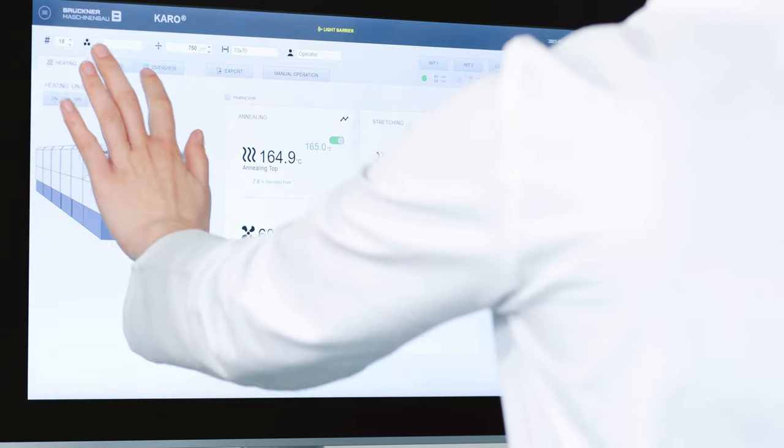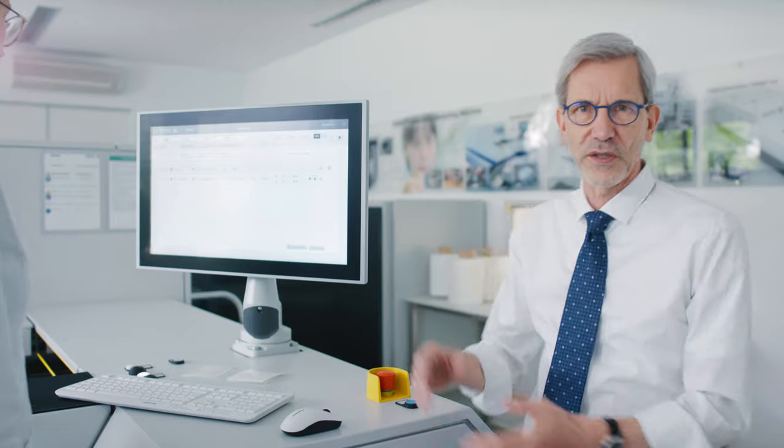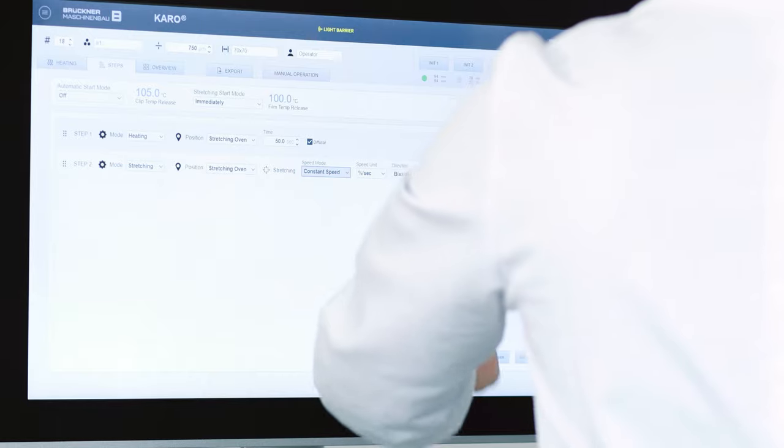Now, let us perform the next trial together with Christina. Last time we only heated the film and stretched it. This time we plan to relax the film and heat set it for a specific time at a different temperature. First, we move to the Steps section. Here, the complete sequence can be adjusted very intuitively. According to the last program, the film was to be heated in the first oven called Stretching Oven, with a heating time set at 50 seconds. In Step 2 we set the Stretching Step, which is also done in the Stretching Oven. Here you can enter whether the stretching speed is constant or changing, and whether to stretch sequential or simultaneous in MD and TD or only in one direction.